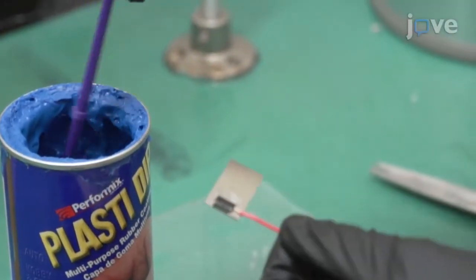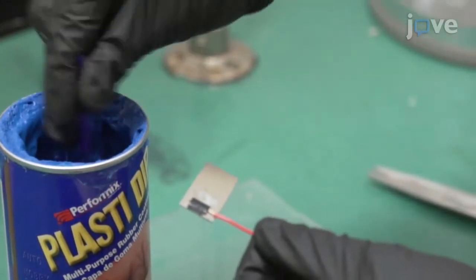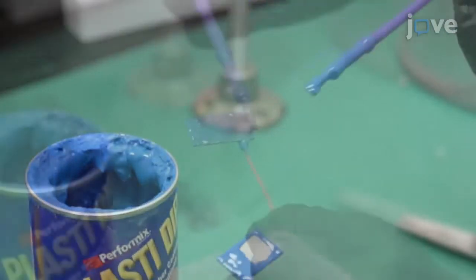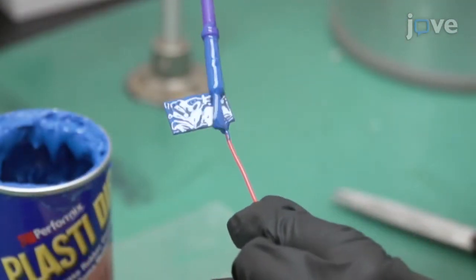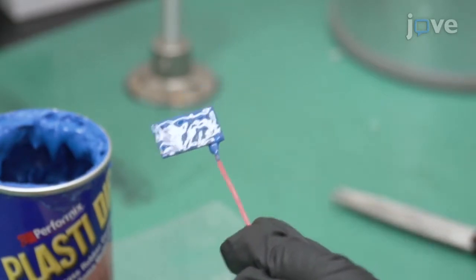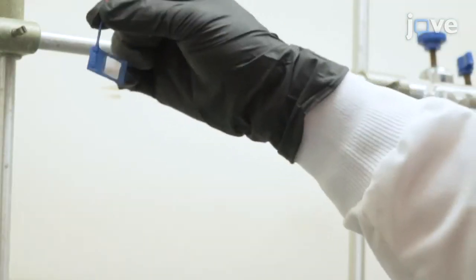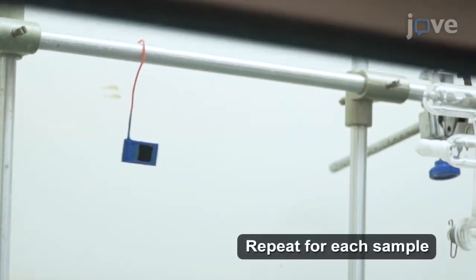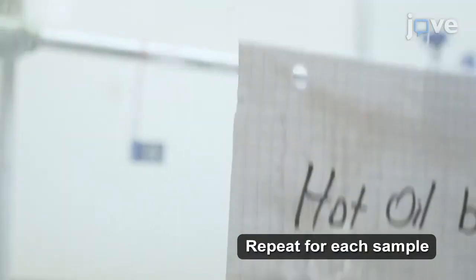Use electrochemical stop-off lacquer to paint a 1 by 1 square centimeter window on the polished side and to cover the entire unpolished side of the sample, including the exposed copper wire. Then dry the painted sample completely in a well-ventilated fume hood for at least 24 hours before the experiments.